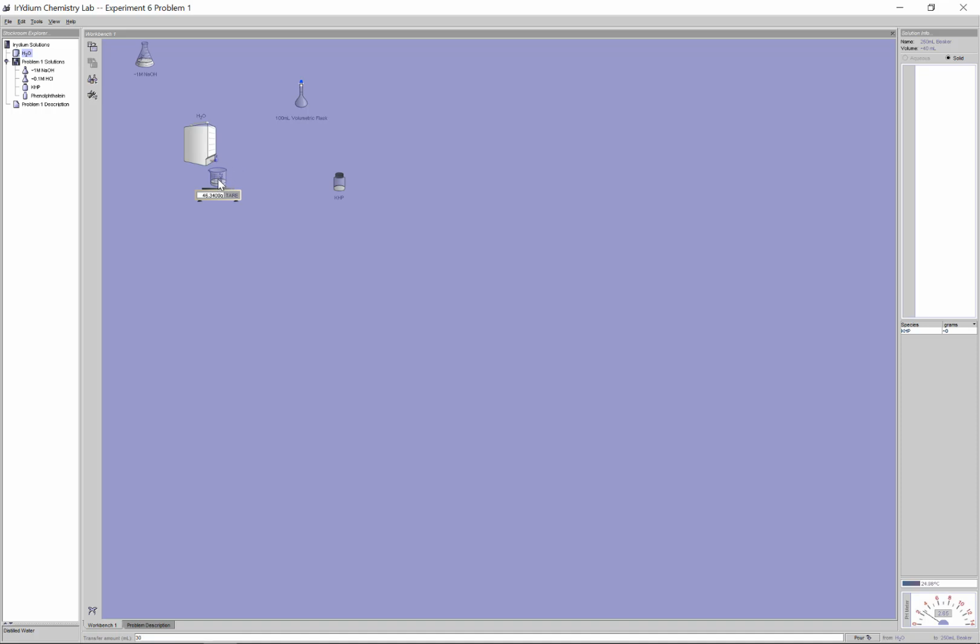When you're convinced the solid has dissolved, you drag this beaker here over top of the volumetric, and I'm just going to pour it in here. Again, type in the bottom 30, just pour that in there. You'll notice very often there's some residue, some leftover solution here. It's a good thing that I wasn't anywhere near 100 to begin with. I'm going to add water to this again, maybe another 30, just so you know that the total is going to be less than 100.